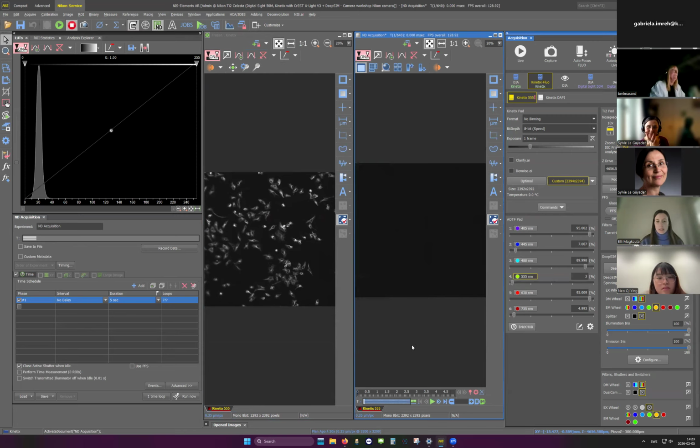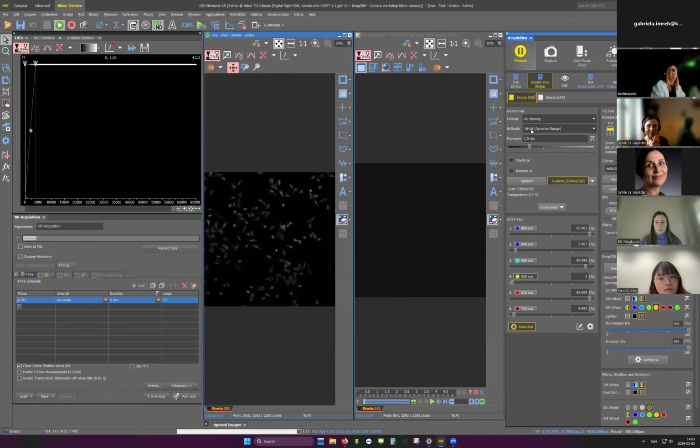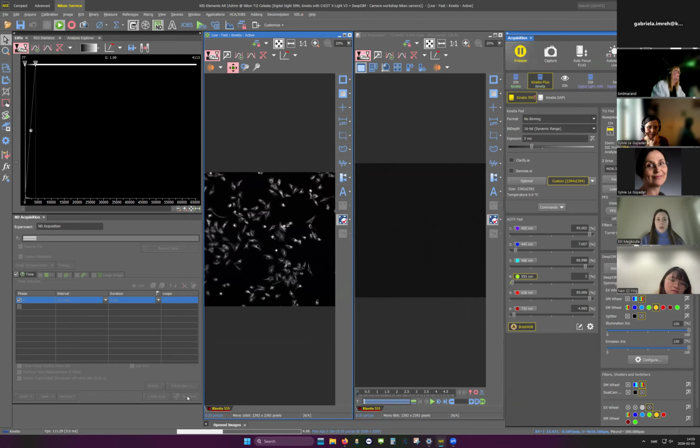That's great. And now I'm going to go to the 16-bit dynamic range. And let's first of all just make sure that we have a nice signal there also, like that. And I will go run now.